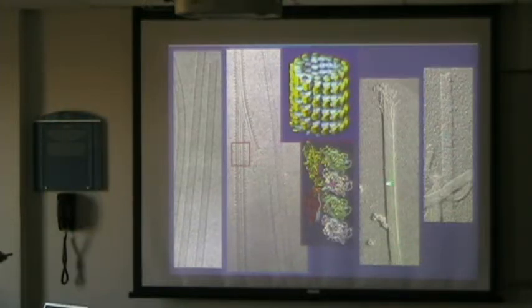You see pretty nice, you see the protofilaments going here, you see some of these things going out. And here, while in this case you really look at the surface, in this case you should think about looking at an object which is made out of glass, and you look through the whole thing. So you see both the back and the top, and you see the entire density superimposed. Well, in this case you really look at the surface only.